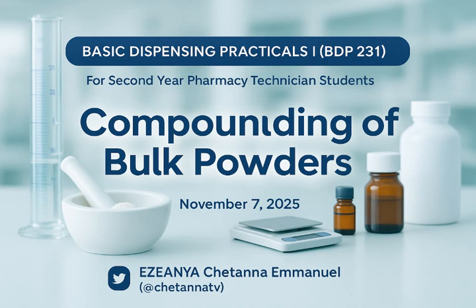Let me use these 3 powders as an example now. In the doubling method, see what you do. If you have 2 powders or more, you start from the one with the smallest quantity, the one that has the smaller or the smallest quantity. Let's assume you have 2 powders. Let me do 2 powders first. If you have powder A and powder B.